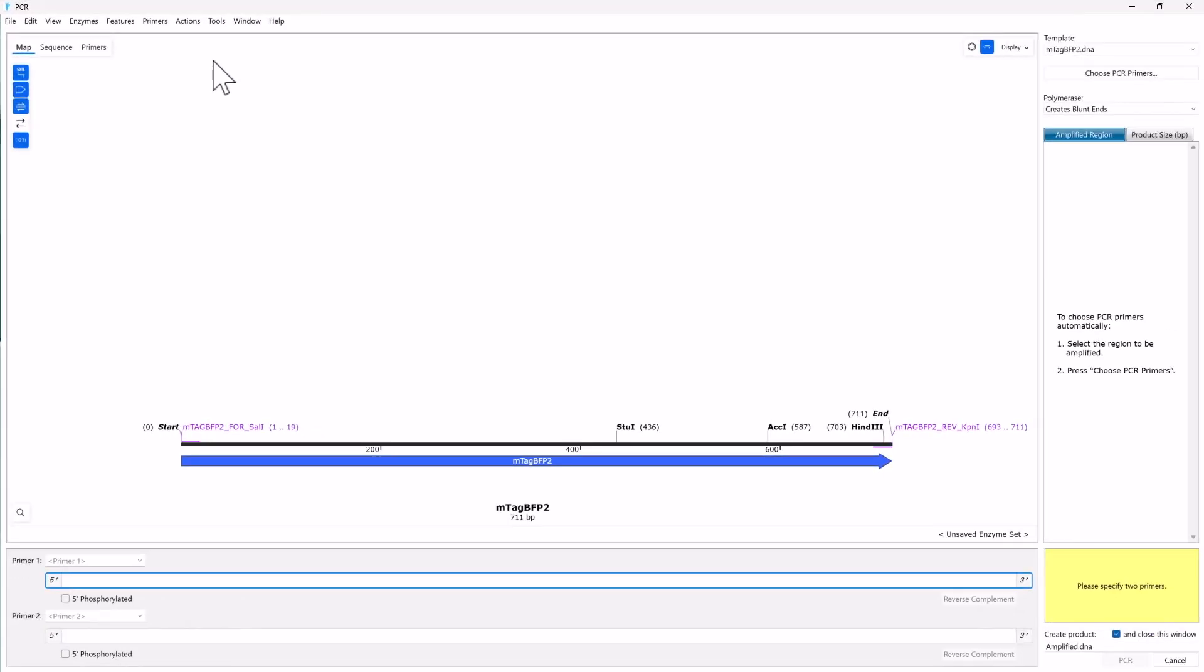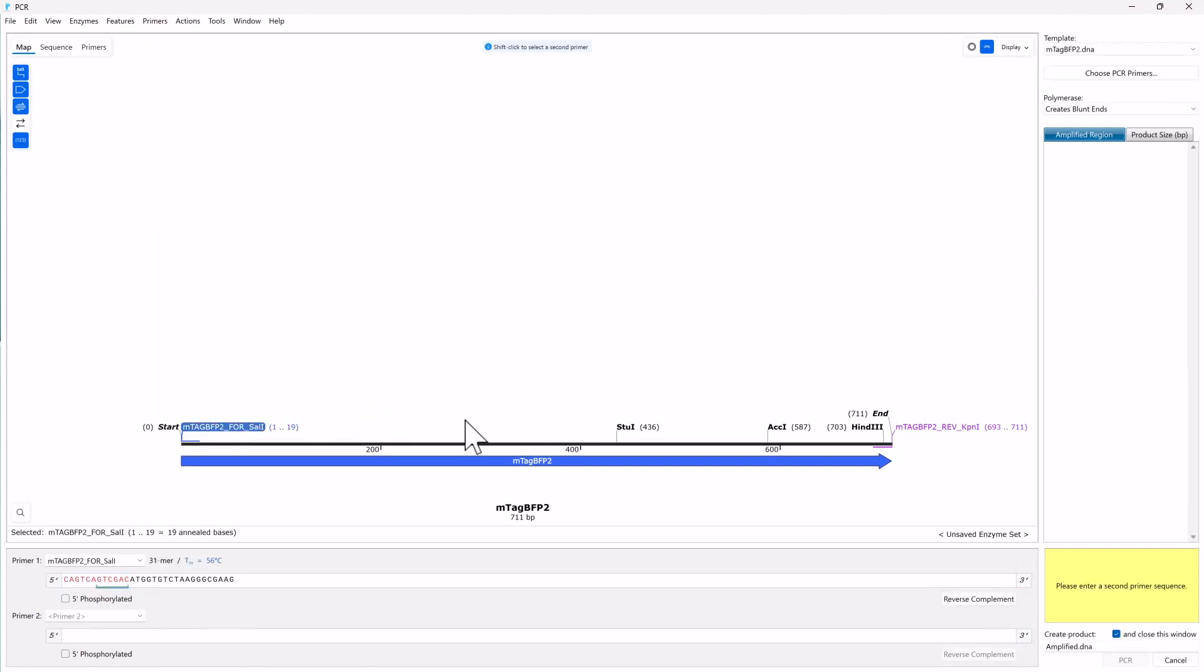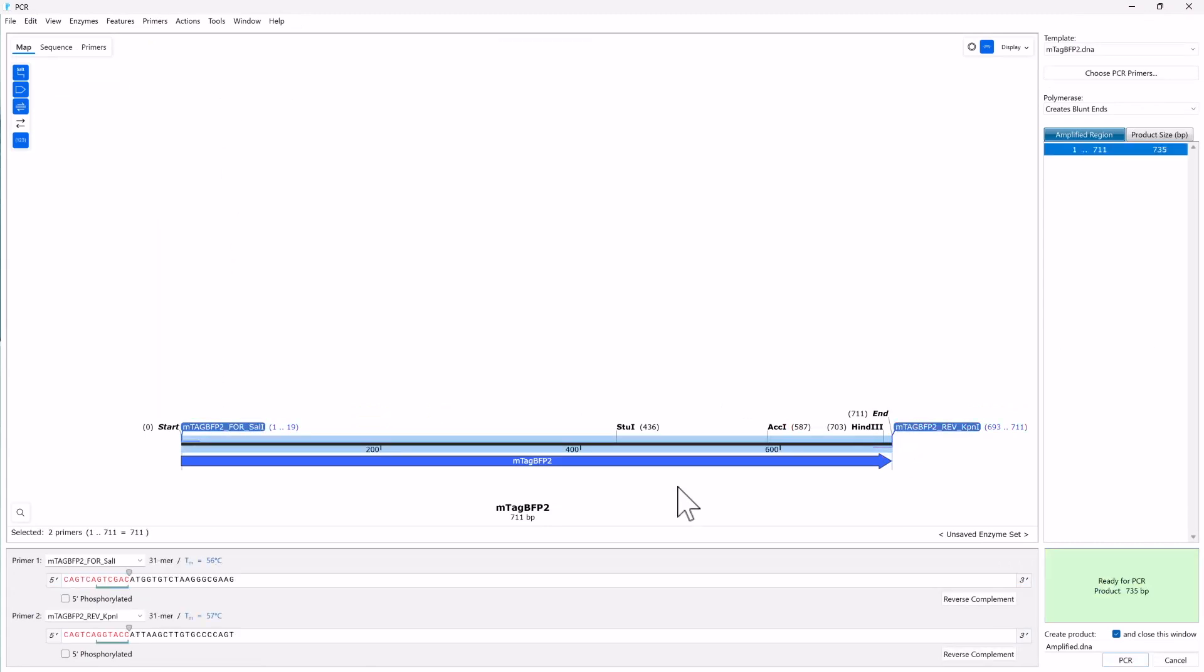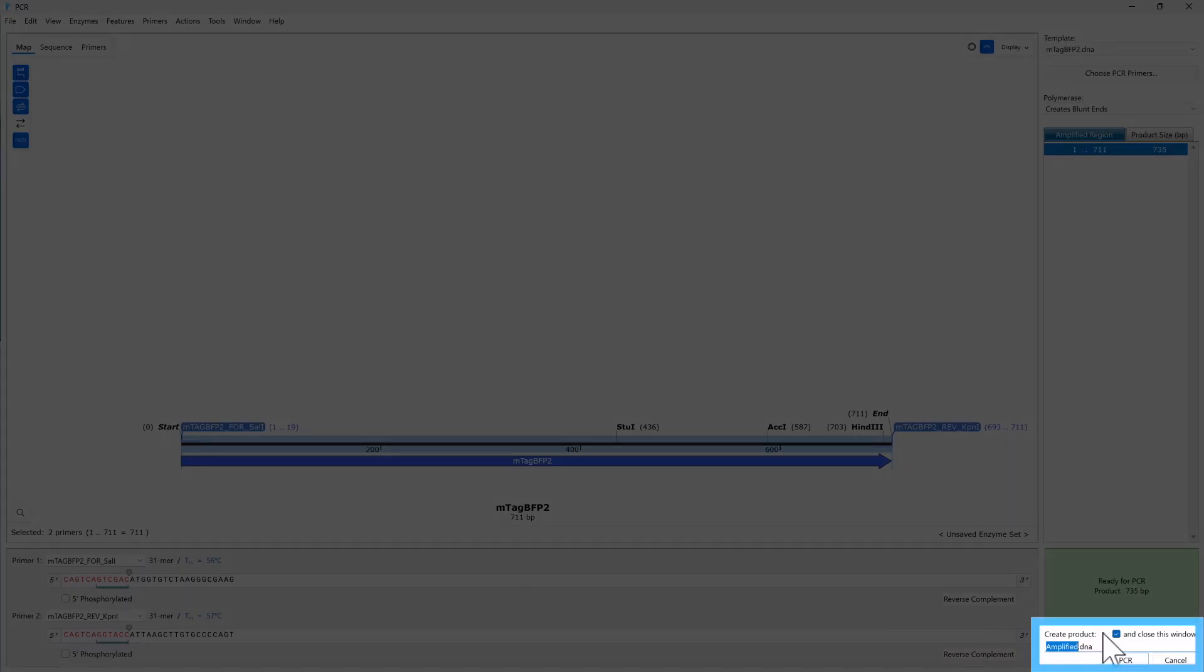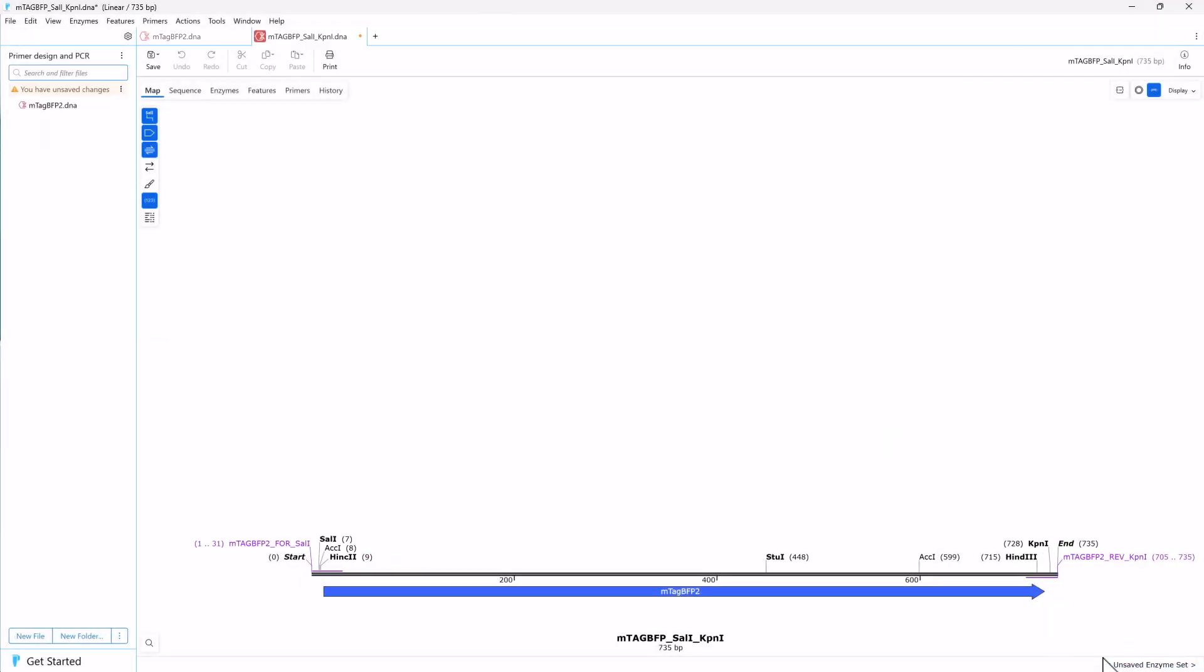To set the primers for PCR, either click on the first primer in the main window and shift-click on the second primer, or use the dropdown menus. Once you have defined the primers, enter a name for the product, then click the PCR button to generate a new PCR product file.